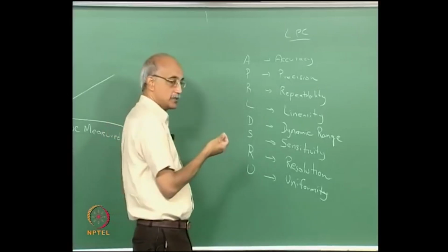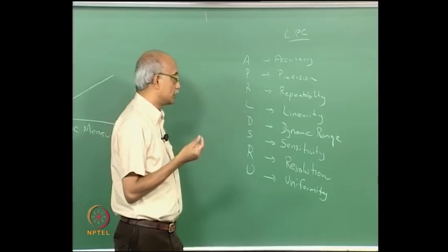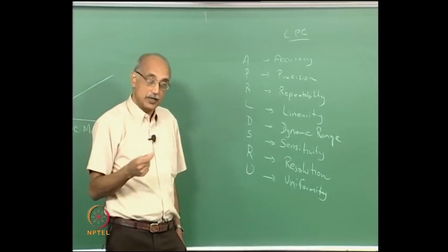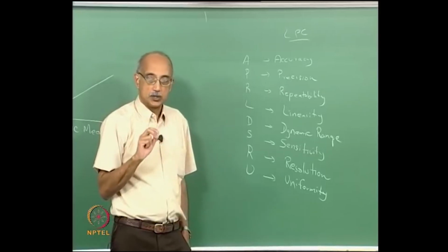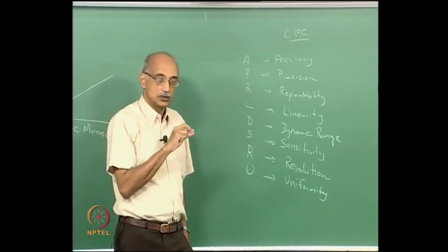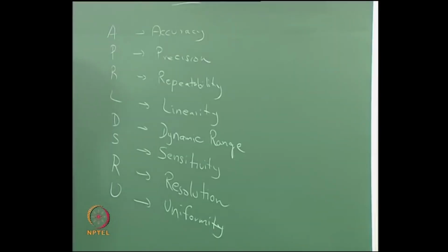how close is your measurement to the real size of that particle, or if you are using a particle counter to do counting as well as sizing of the particles, then you really have two metrics: how close is your count to the actual count and how close is your size to the actual size. So, accuracy is a measure of how well measured values relate to reality.